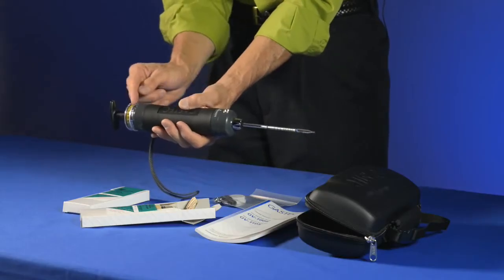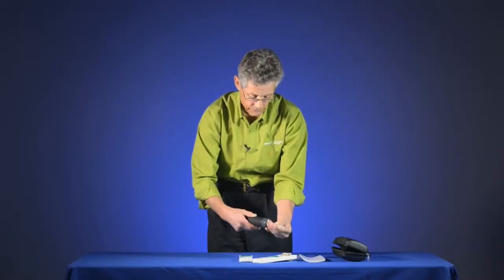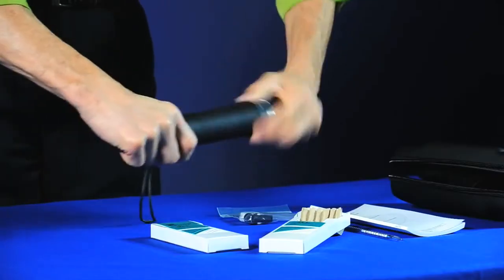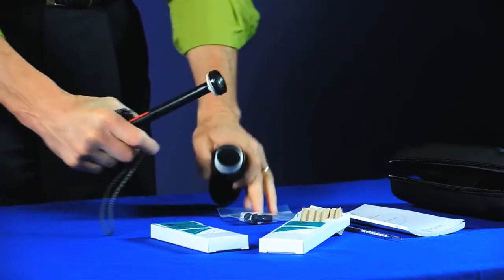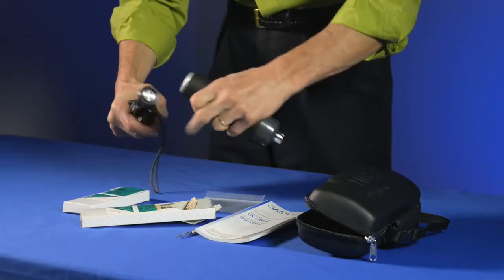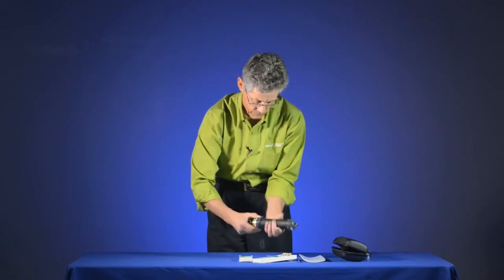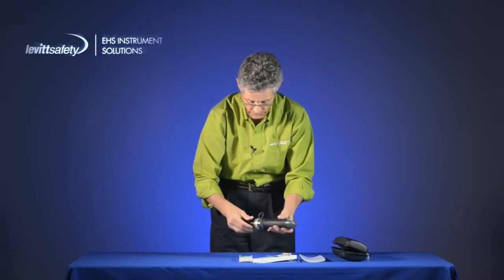If the handle returns to its original position, this indicates there were no leaks in any parts of the system. If it did leak, you may need to replace the flange at the end, or open the pump and use the grease in the small container to re-lubricate the end of the pump and cylinder itself. Then you would want to do another leak check.